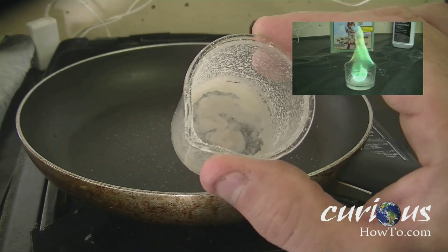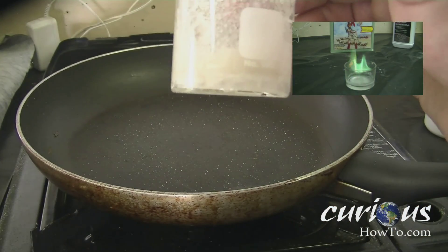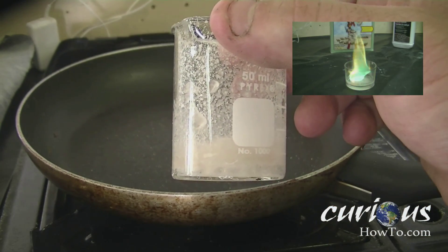Do you need to learn how to make boric acid? Today in our video we're going to show you how to make boric acid, which we later use to make green fire in a different video that you may enjoy.